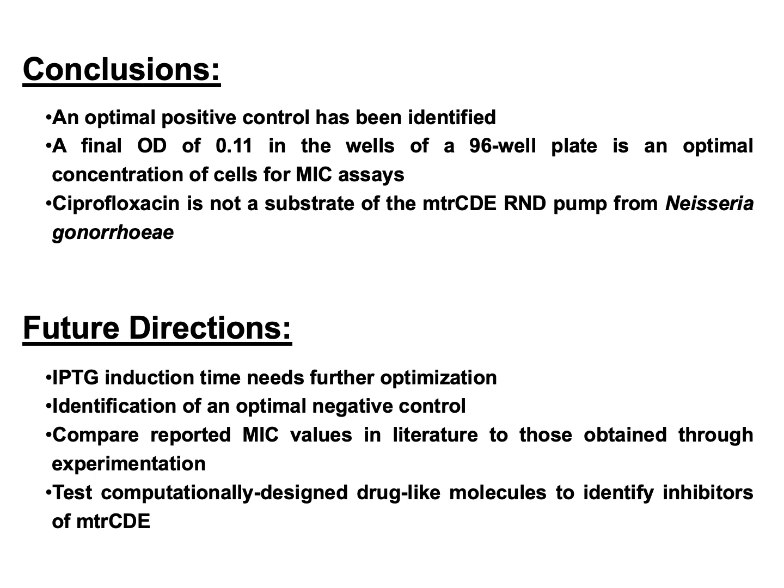So far, this research has produced an optimal positive control, an optimal final cell concentration, and the finding that ciprofloxacin is not a substrate of mtrCDE. These findings have improved the MIC assay.